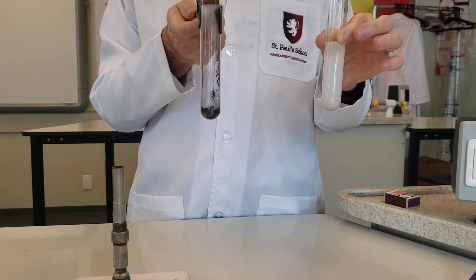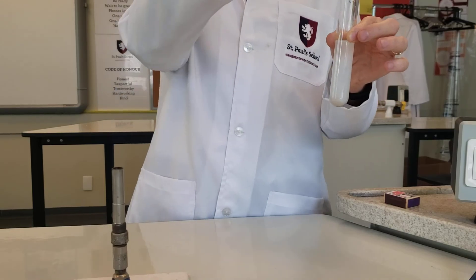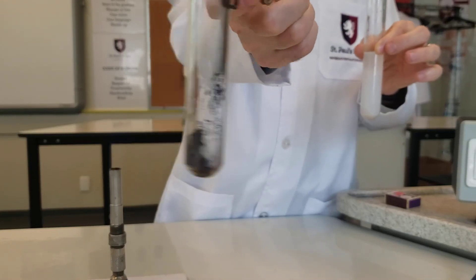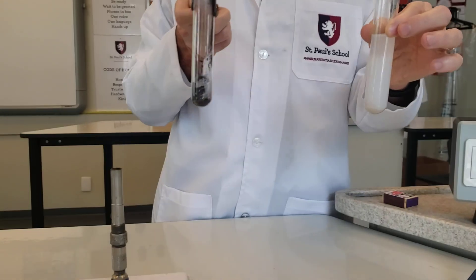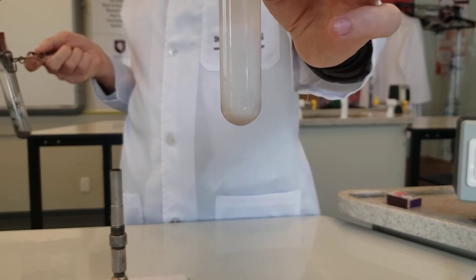That is the heating of copper carbonate. There we are. There's my black copper oxide and carbon dioxide form. It turns lime water milky. There we go.